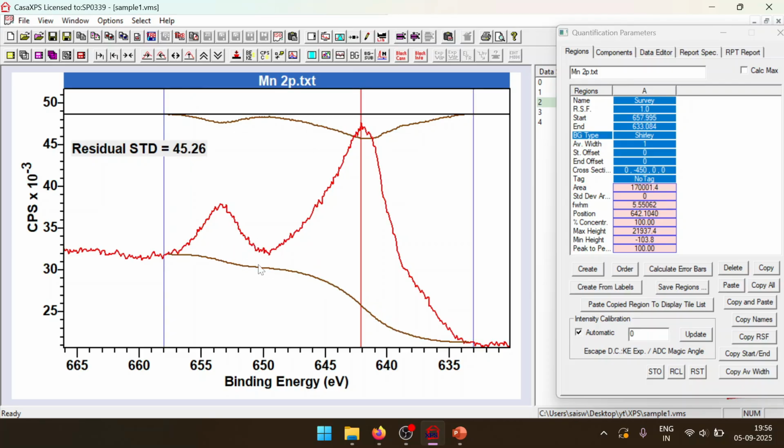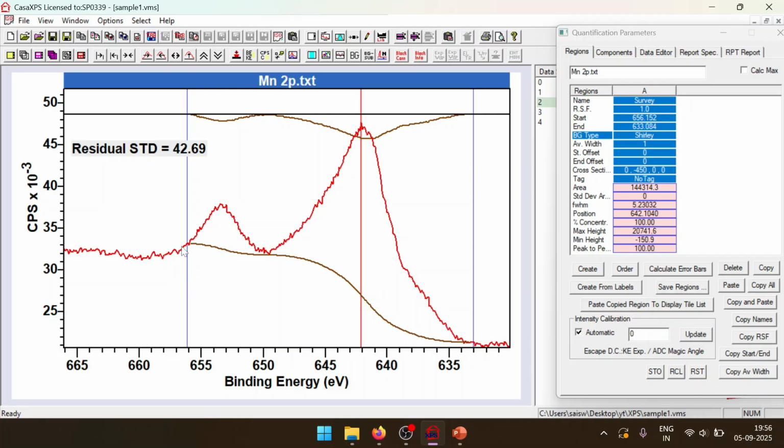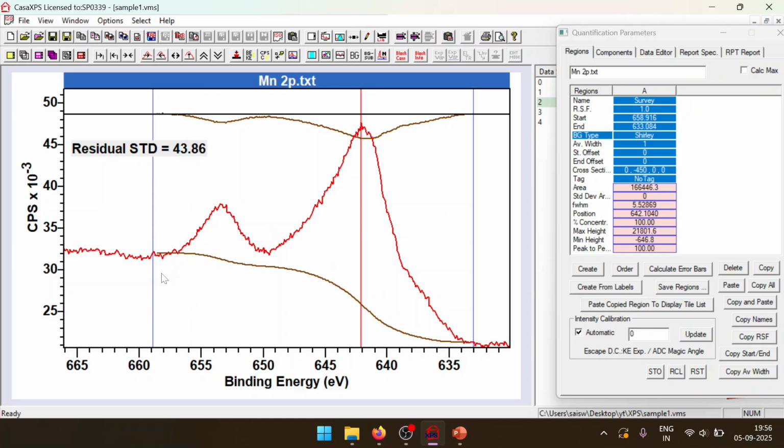That is, there is a peak here, else when I brought it closer, it should have touched. It is not touching, which means there is a peak or something here which is stopping it from touching. So I should not forcibly make it touch by putting something like this, because now I have lost my peak area in this part. So your intuition should work here, and don't make a mistake here. There is a peak here, so consider that.